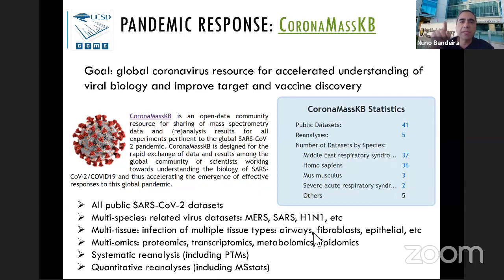It's just PXD followed by a number. And the answer is absolutely yes. You can get that at MassIVE, and you can get that at any ProteomeXchange repository. As long as the repository is part of the consortium, you'll get the PXD identifier that you can use for publications. So absolutely yes, you can definitely get it if you do it at MassIVE.